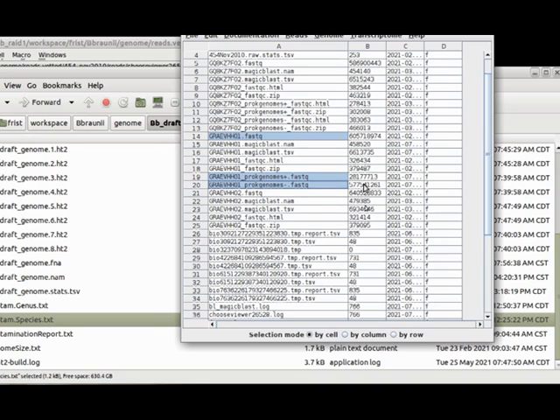And then the larger file is the minus file, the presumptive eukaryotic algal sequences that didn't match the contaminants. So we would be able to extract the reads and just use these reads as the ones that we use for genome assembly when we're trying to assemble our algal genome, and hopefully be able to get a better result from that.